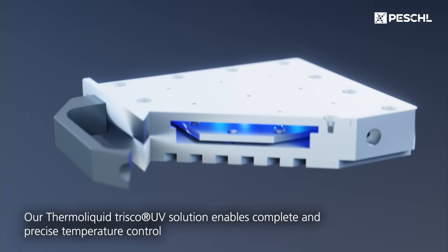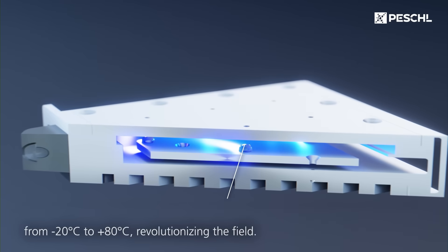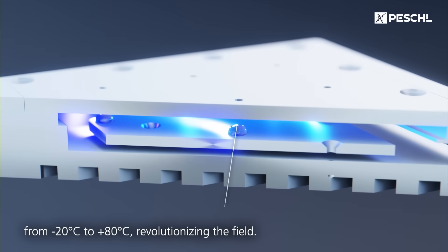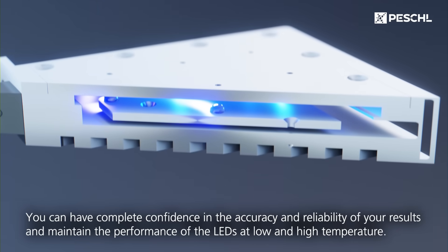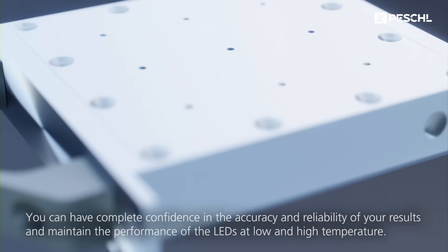Our ThermoLiquid Trisco UV solution enables complete and precise temperature control from minus 20 degrees Celsius to plus 80, revolutionizing the field. You can have complete confidence in the accuracy and reliability of your results and maintain the performance of the LEDs at low and high temperatures.